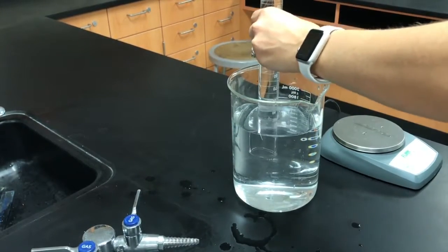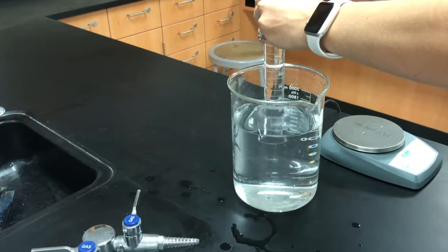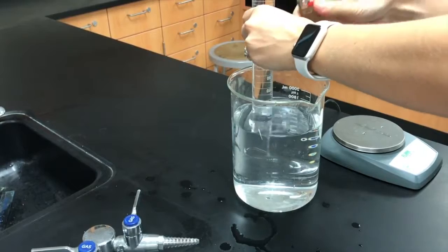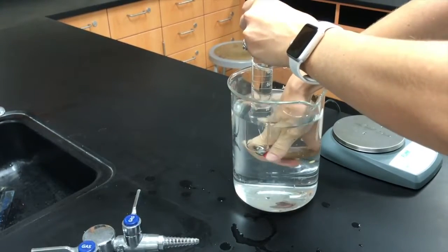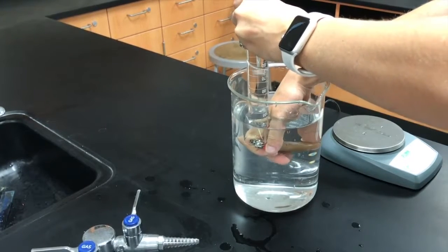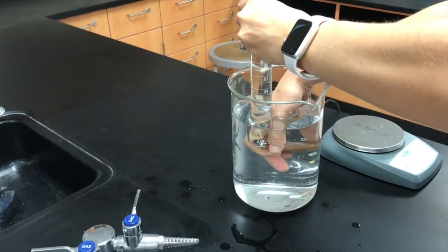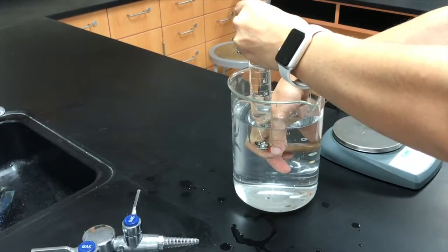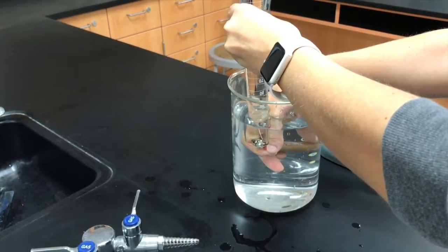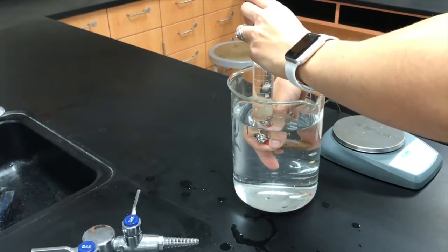Now I'm going to collect the gas. So I'm going to take the lighter, okay? And I'm not going to actually have the lighter start because I'm not creating a flame. This is what actually creates the flame, but the red button is what releases the gas, the butane. So I'm going to stick the lighter underneath the graduated cylinder, and I'm going to release gas. And you can see that gas being released as bubbles. Okay, so you're going to release it until you have collected at least 60 mL of water displaced. Okay, so this is going to go until you hit about 60 right here.